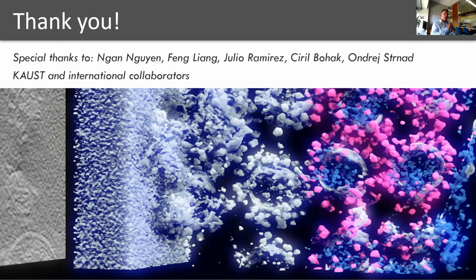In fact, one thing which could be useful in this context is to use the subtomogram averaging methodology. By knowing that there are many similar structures in your data, you can use this concept of superimposition in the denoising approach.